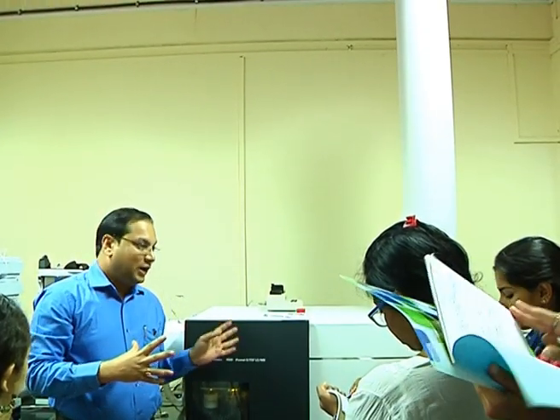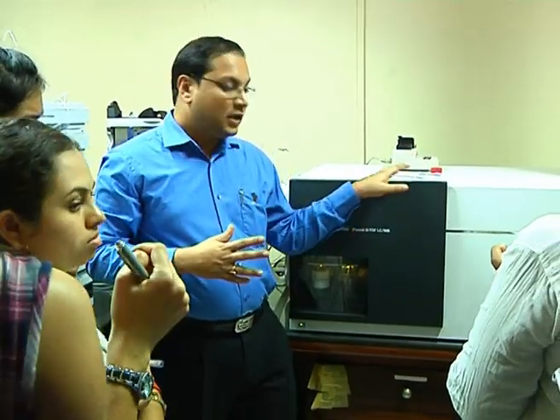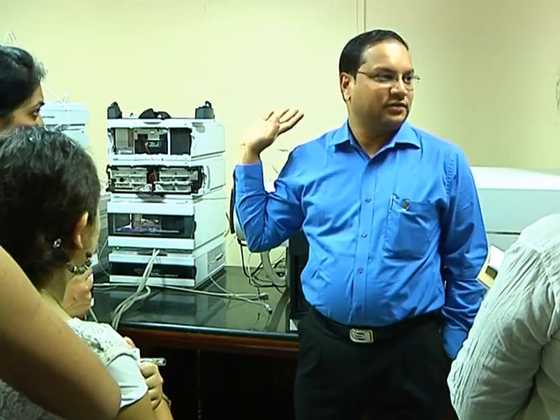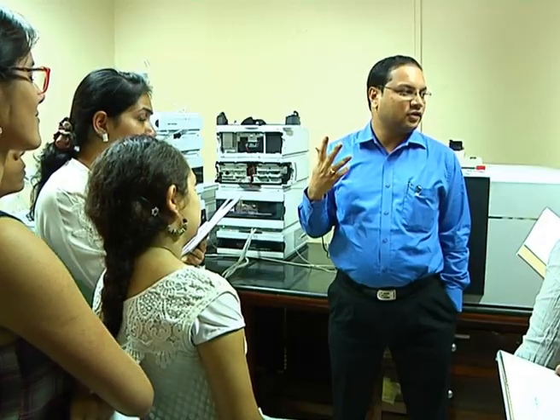Okay, meaning in tandem with respect to doing an MS. So there are two different analyzers, quadrupole and time of flight, and that is coupled to an HPLC. That's why we call it an LC-MS, HPLC-MS. So you know there are thousands of proteins in the family.